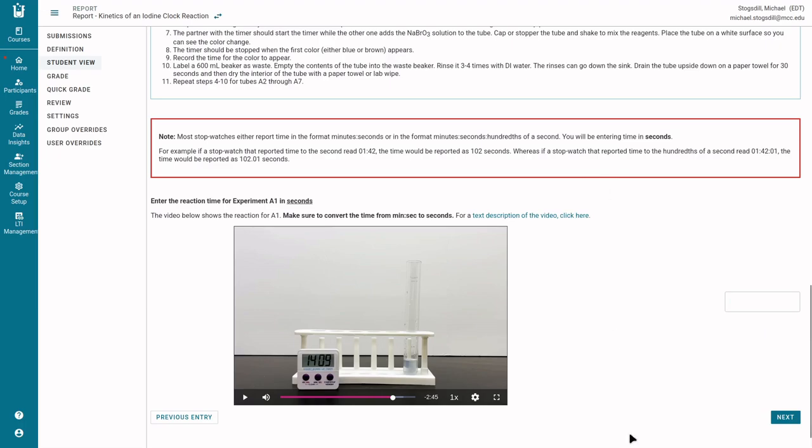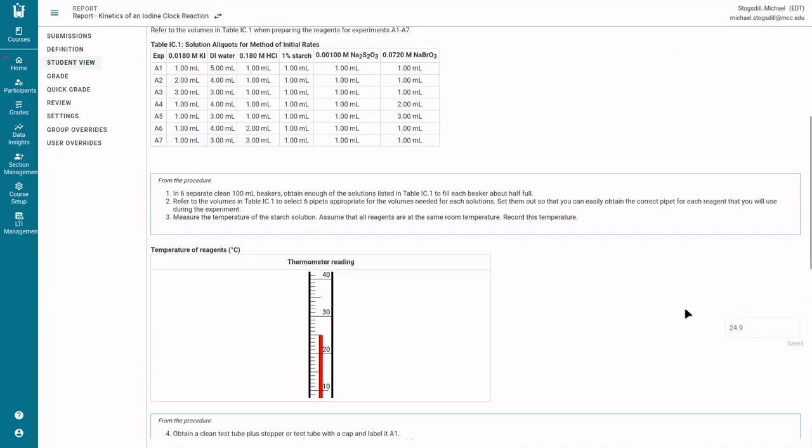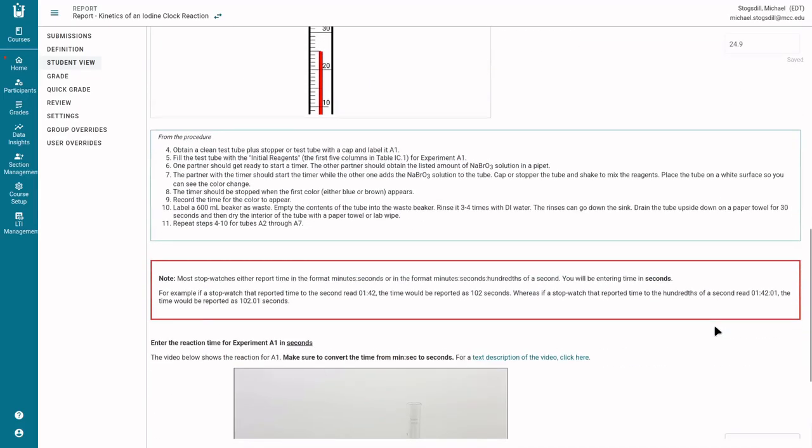Now, I'm not going to go through the whole thing, but I'm just going to tell you that if LabFlow thinks that any of your values aren't reasonable, it's going to give you a little cryptic message down here. It does tell you which one it wants you to change, but then it just dumps you back to go back through this cycle again. And it does still have the old value that you put in there.